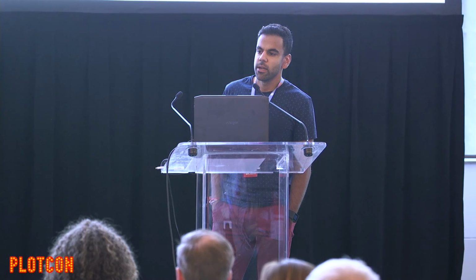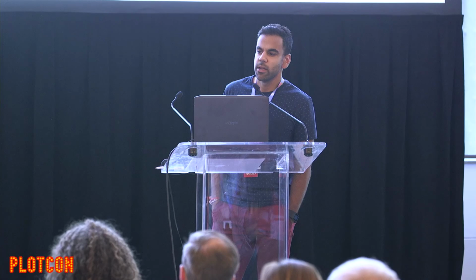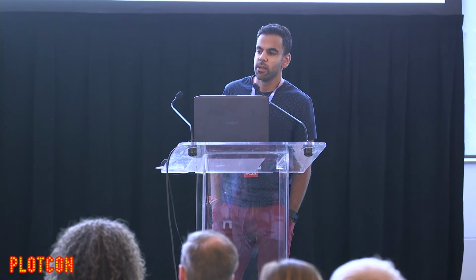Another potential feature request. Thanks for the great talk. I guess one of the issues that could be hampering the interpretability is that all of the points now are interactive. Could there be an option to add another argument to the plotter so that only above a certain log p-value those points are colored or interactive, and then if you're mousing over the points that aren't even significant, they're not getting pop-ups all over the place?